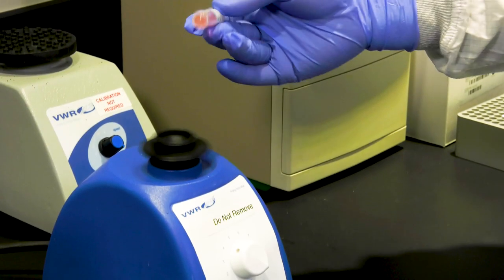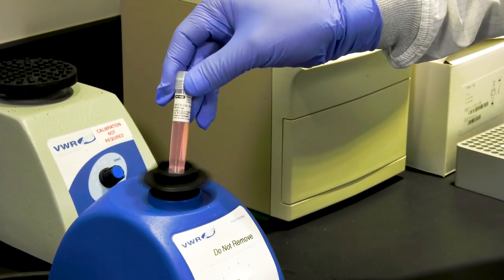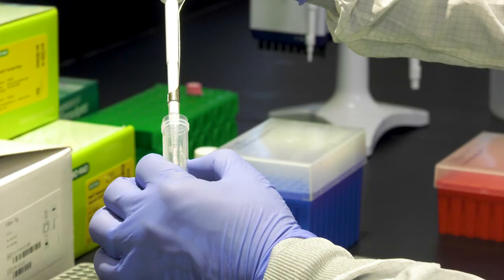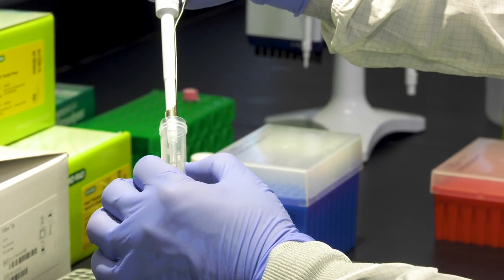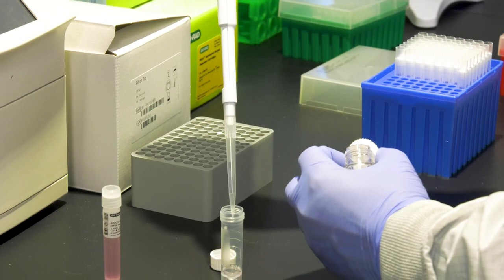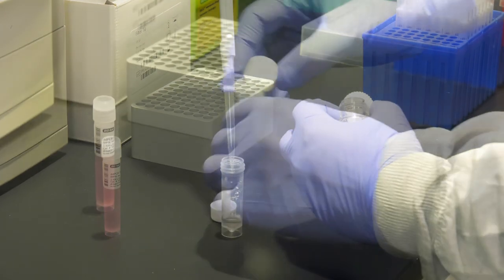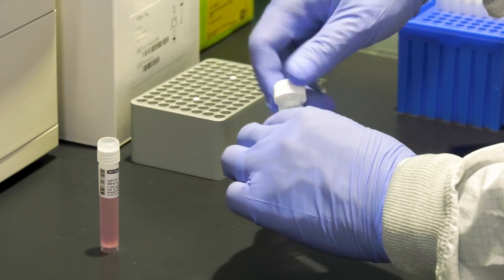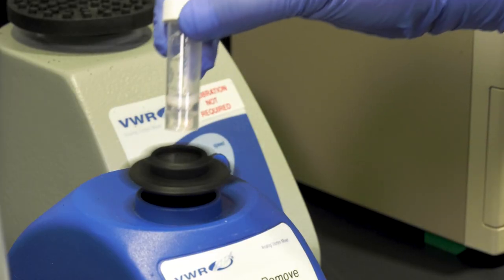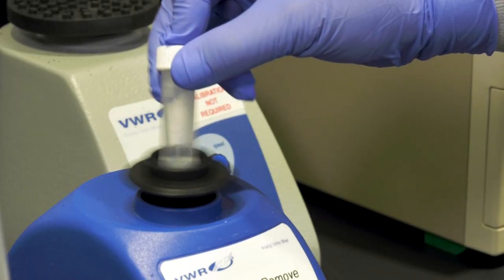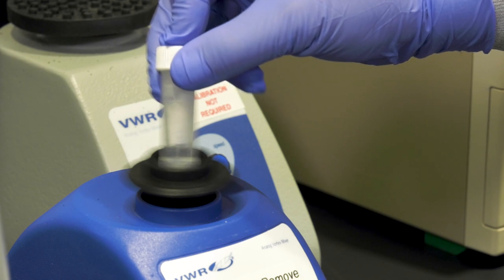Next, vortex your assay and add it and an appropriate amount of nuclease-free water to the tube. Cap the tube and vortex it thoroughly for 5 seconds at maximum speed so that it's homogenous.